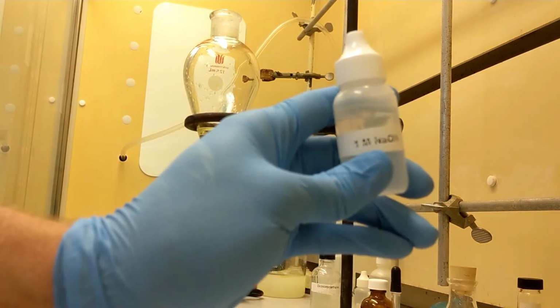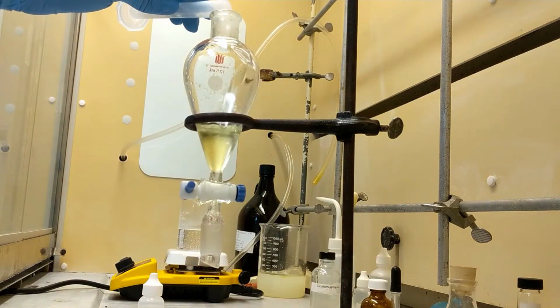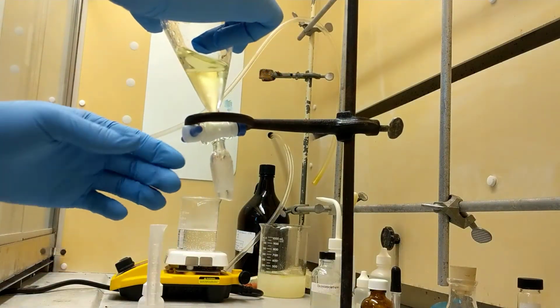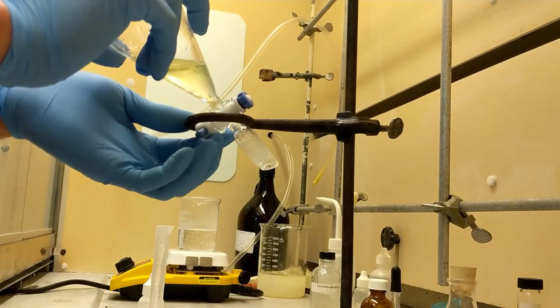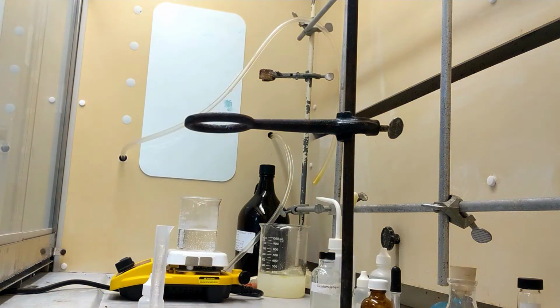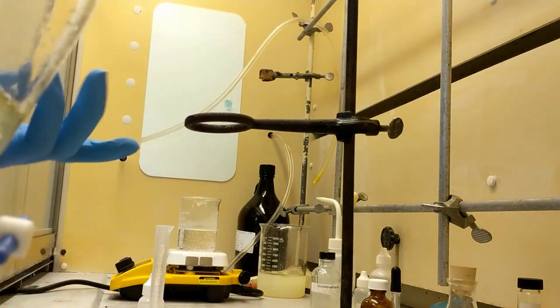1 molar NaOH. 5 milliliters into the separatory funnel. Just like that. I'm going to put the cap on. Now I'm just going to shake it. I'm just going to shake the separatory funnel like I did for experiment A, and then I'll see you guys back for the extraction.